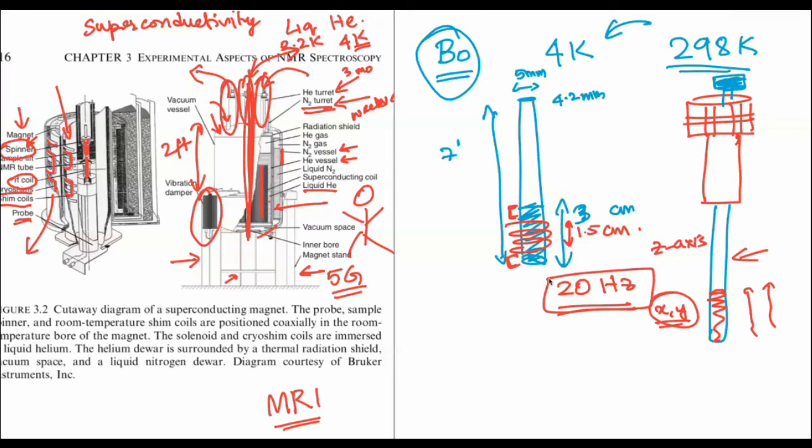Okay, sir. So the airlift is definitely required. So never ever put the sample without the spinner. Spinner is extremely crucial because that is what helps the airlift push the sample out. If you don't have the spinner, the air will escape and your sample will always remain inside. So that's a problem. Spinner is utmost required whenever you put a sample in.